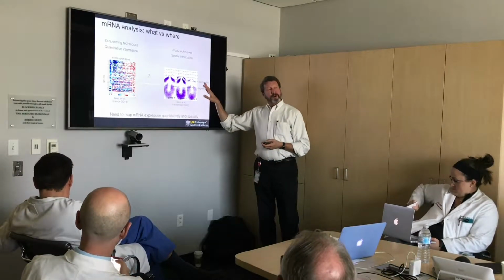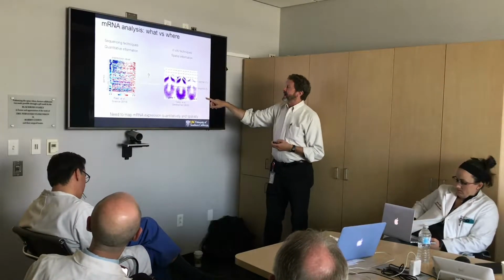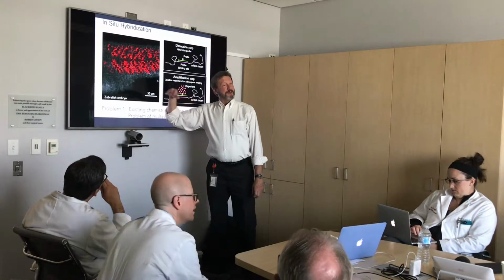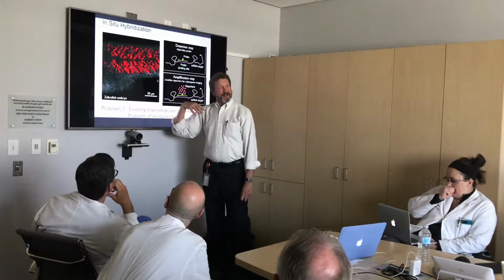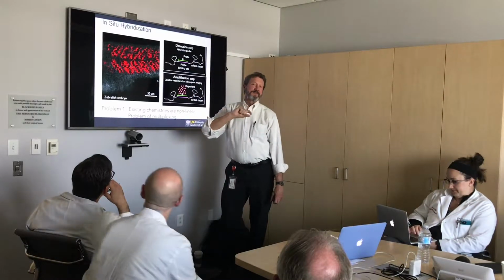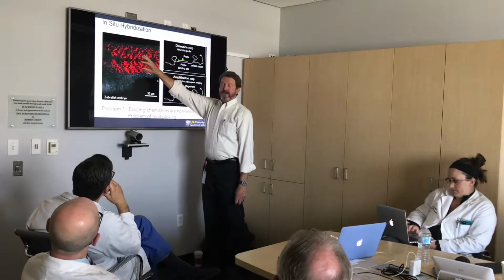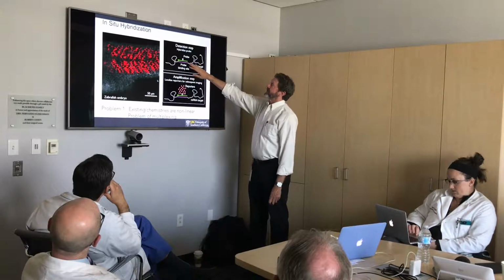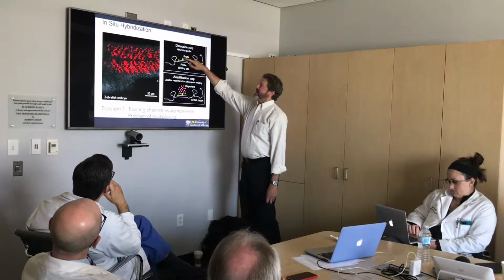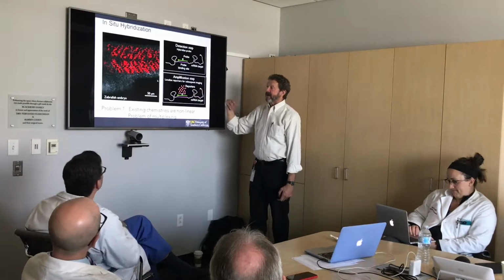And the problem is that most in situ technologies for looking at where those genes are expressed are inherently problematic. Okay, so all the tissues, every piece of biopsy, intravital looking in lung or kidney, whatever, there's always autofluorescence, right? And people get away from that in part by taking thin sections, but it's still there. So to get the signal from the in situ hybridization above the background, the typical approach is to use an antisense probe that hybridizes to the target RNA. The probe, instead of being a dye, is an enzyme. That enzyme processes some colorless molecule and makes it colorful.